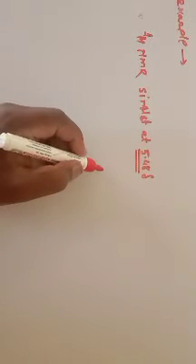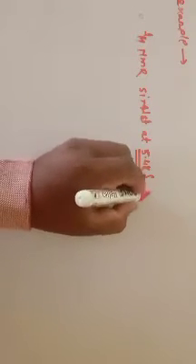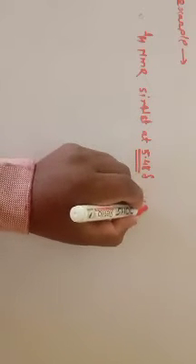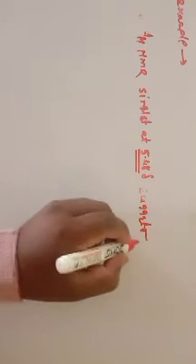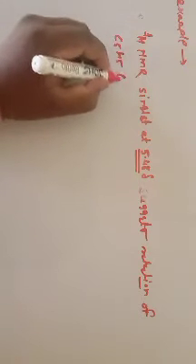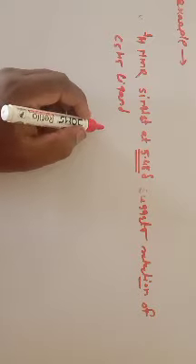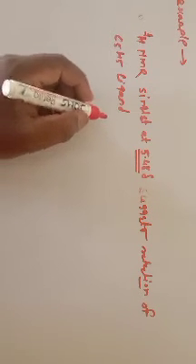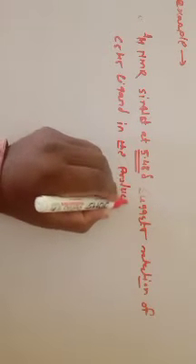So this H1 NMR singlet at 5.48 delta suggests the retention of the C5H5 ligands in the product. So this is the important point.